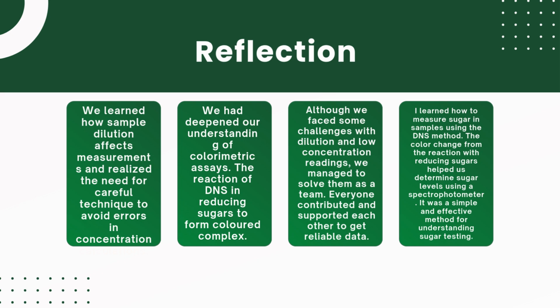Lastly, I learned how to measure sugar in samples using the DNS method. The color change from the reaction with reducing sugar helped us determine sugar levels using a spectrophotometer. It was a simple and effective method for understanding sugar testing.